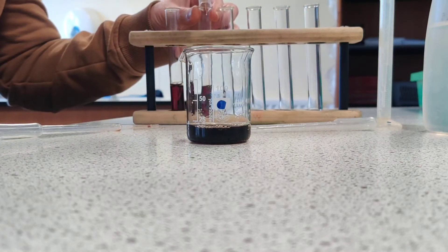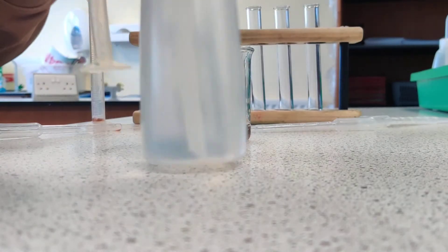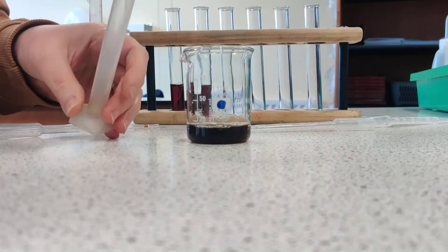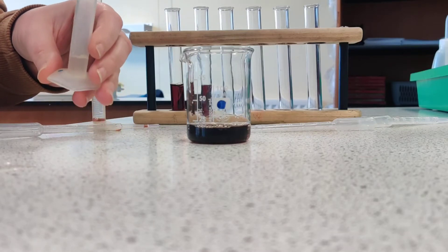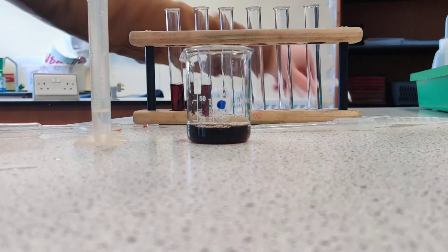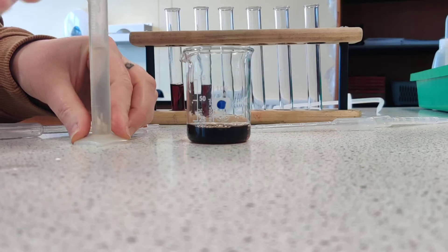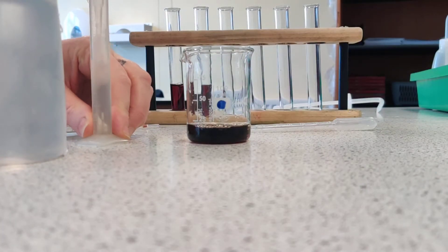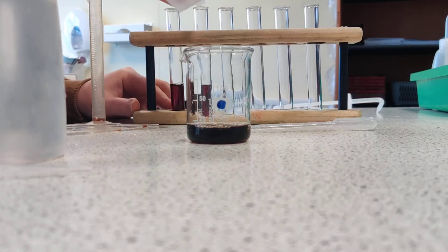I'm mixing that with 5 cubic centimetres of distilled water. Distilled water is water that's got nothing else dissolved in it — it's a pure sample of water. Now you'll notice I use different pipettes — I'm not mixing my blackcurrant juice and my water pipettes.